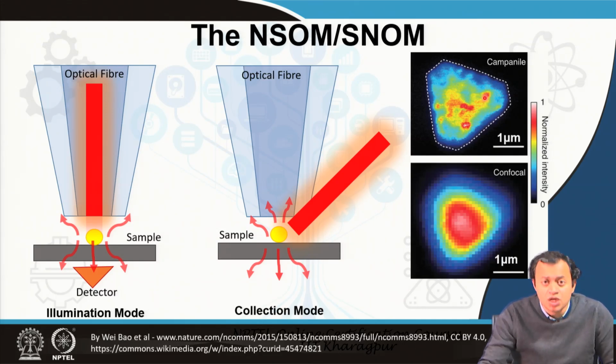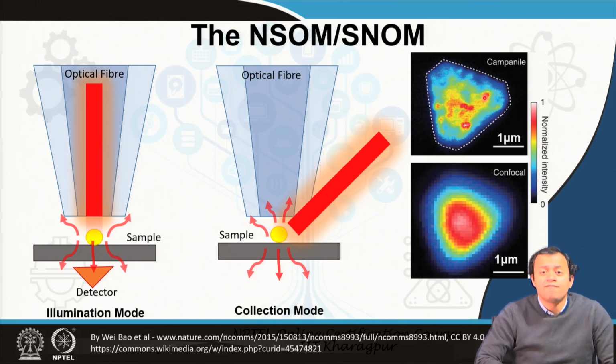We are able to image areas far, far below the resolution of the diffraction limit. Why? The diffraction limit states that this is the resolution, which cannot be crossed because the field cannot enter. 99% of the light wave cannot enter, 99.9% of the light wave cannot enter. A meager sum, 0.01, negligible, near field can enter, near field can go through. It does not play by the rule. We utilize that, and that has revolutionized.